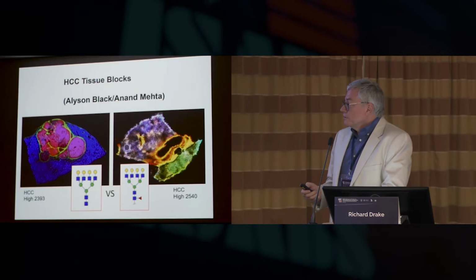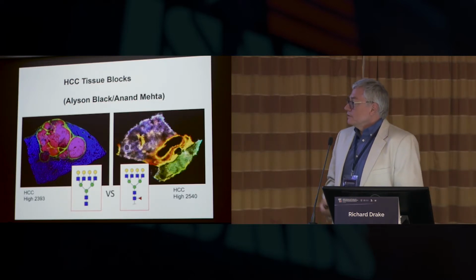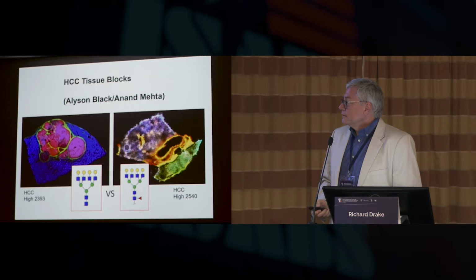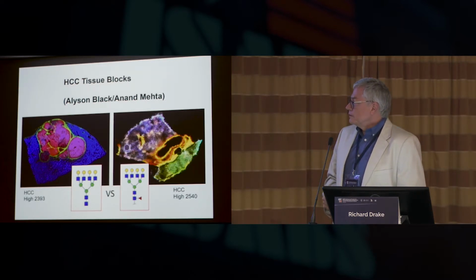Monfort also showed, and of course with the immunoglobulin G profiling studies, glycans can be very clinical, and we're all moving in that kind of direction. At the tissue level, this is what we see routinely in liver cancers. Generally two types. One is illustrated on the left, and that's the type highlighted by that tetraantennary glycan without the fucose, versus the type of tumors we see with the fucose. It's sort of a base comparison.